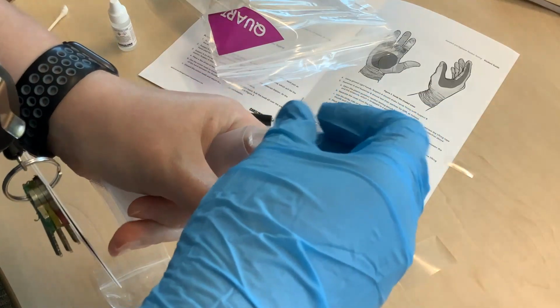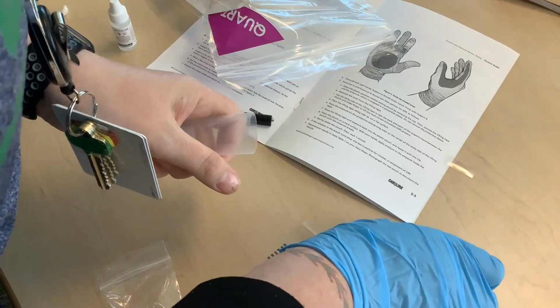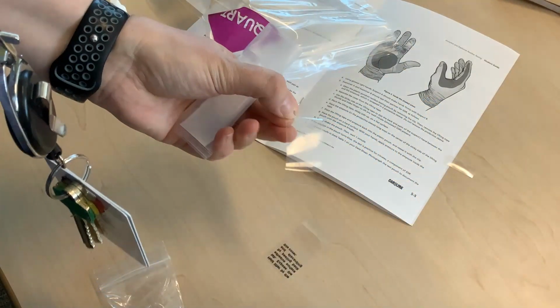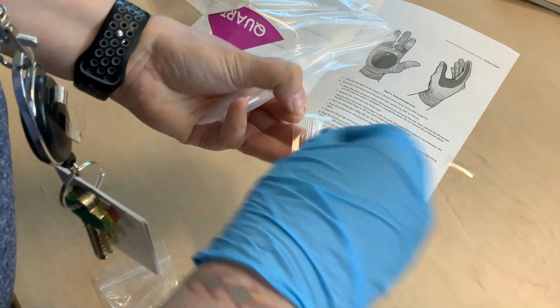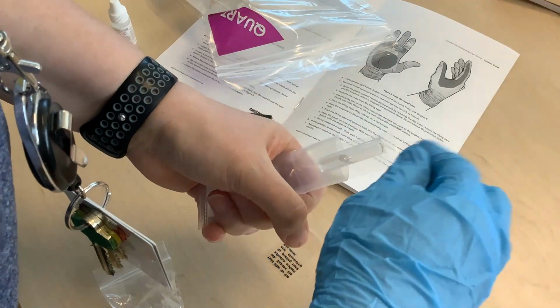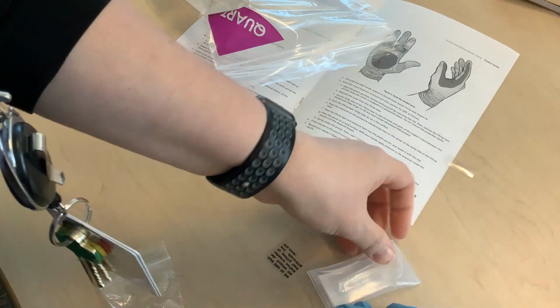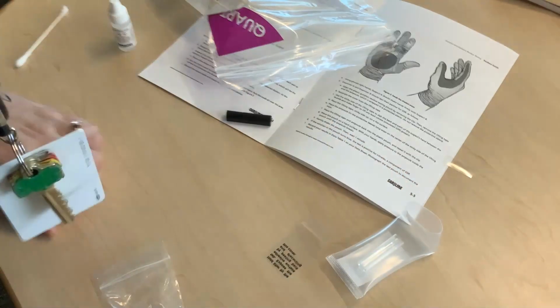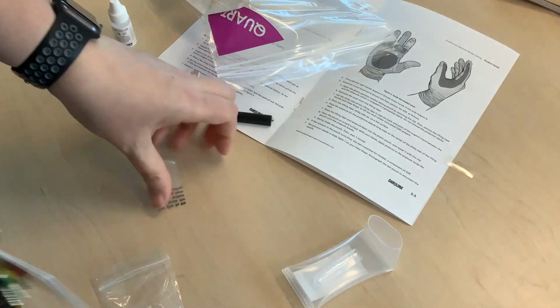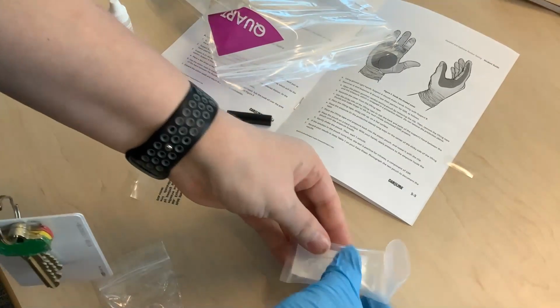Then I'm going to take this, and it says, place the ampule in the protective sleeve lengthways on the center of the sticky tape of the lifting tape, and place the lifting tape and the ampule back into the plastic pouch. So I'm going to put my ampule right there back into the pouch very carefully. I'm going to close it up. And then basically you have to break the ampule. So you very carefully, there you go.